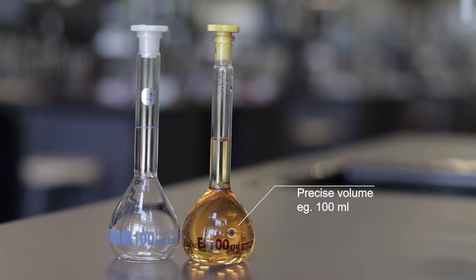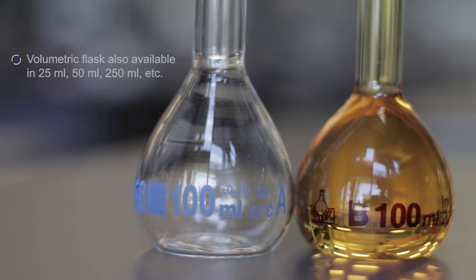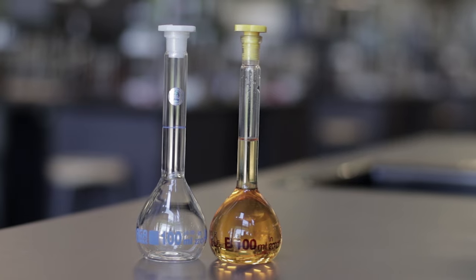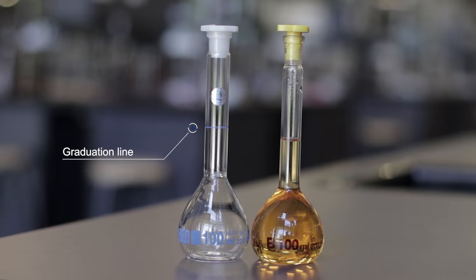Volumetric flasks contain a precise volume at a particular temperature and can be found in different volumes and sizes. Solutions are made up until the graduation line which indicates the desired volume.